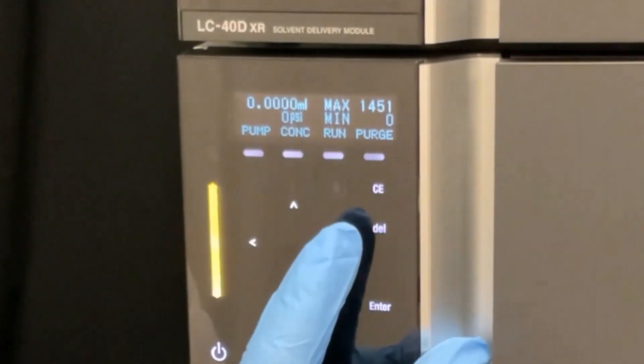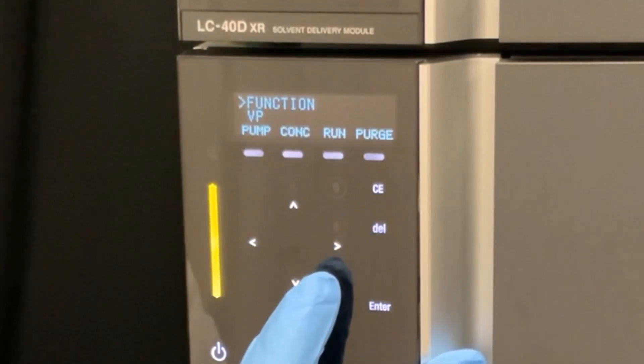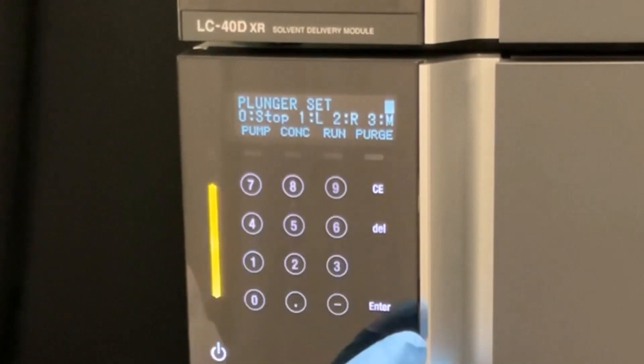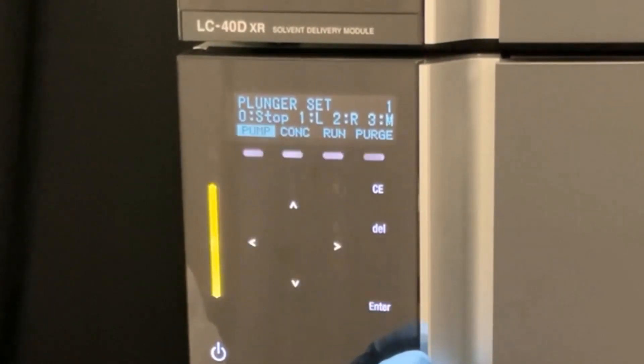From the main screen, press the right arrow twice, then press the down arrow so the cursor is next to control, then press the right arrow and then enter. From the options, use the keypad to select the pump head you will work on, either left or right. Make your selection and then press enter.